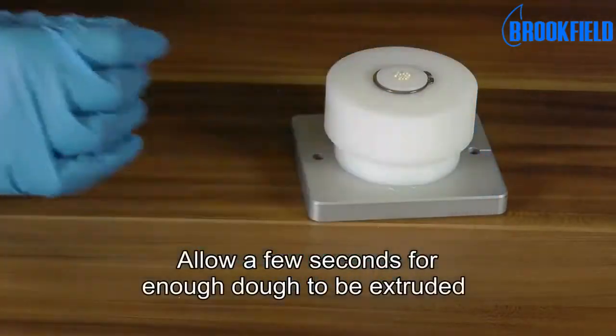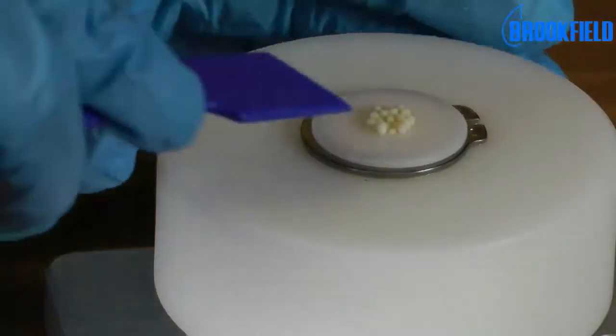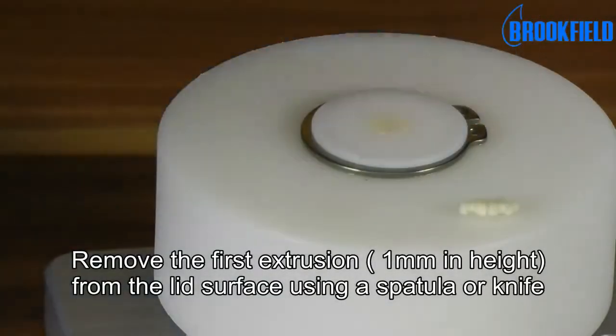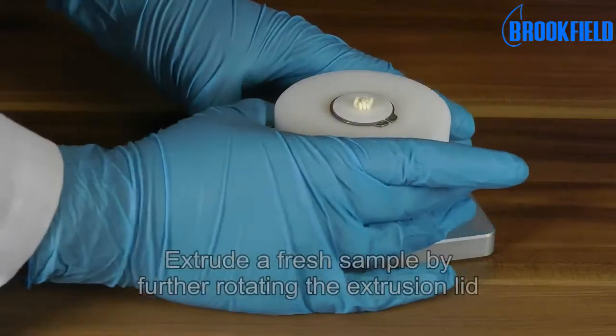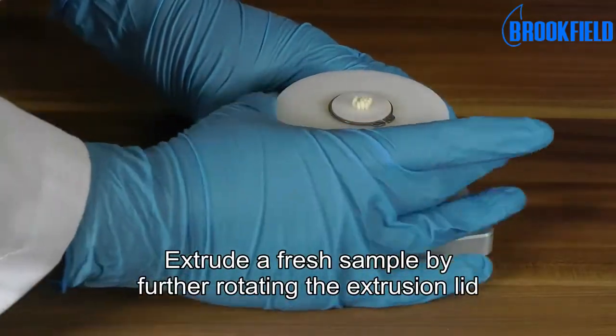Allow a few seconds for enough dough to be extruded. Remove the first extrusion from the lid surface using a spatula or knife. Extrude a fresh sample by further rotating the extrusion lid.